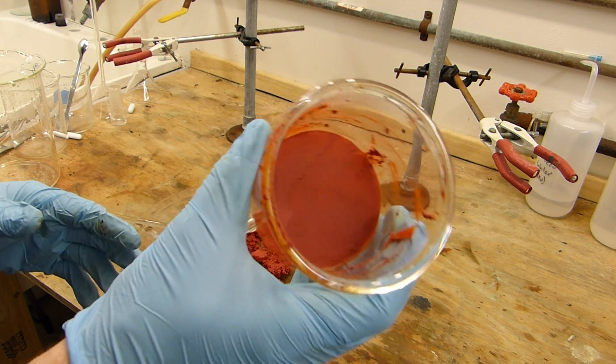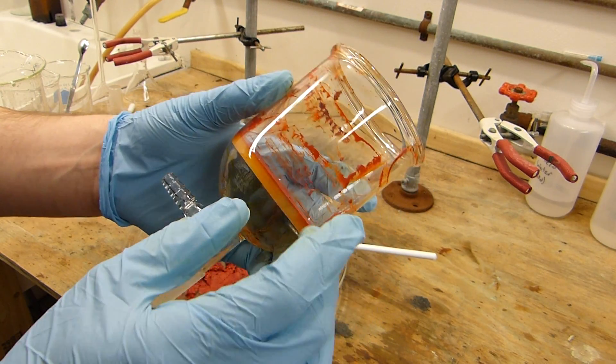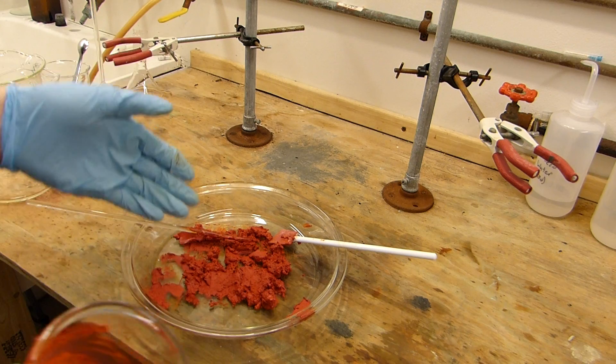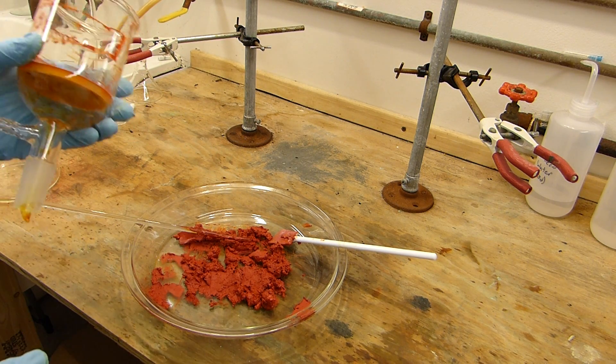I suppose I should have cycled the temperature a few more times to increase the crystal size. Next time if I do this, I'm definitely going to do that. But anyway, I've got a decent yield. I'm going to try and get it off this rubber spatula as soon as possible because it's probably going to eat right through it.